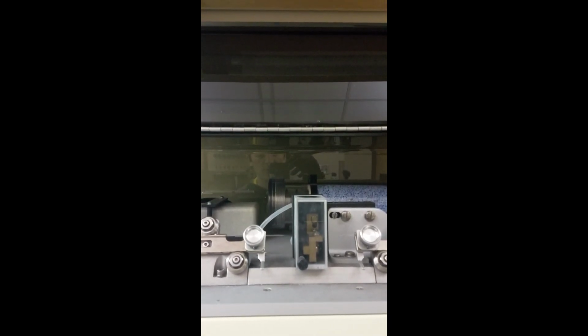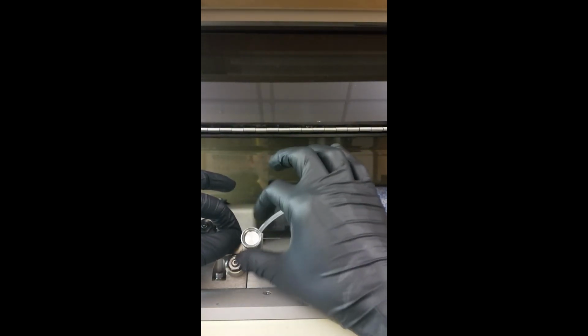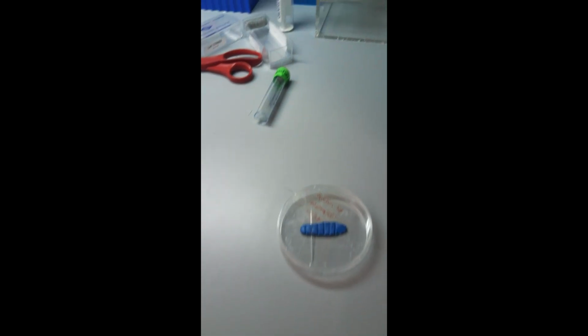You can open the lid and take out the new tips. So you just loosen this until you can pull this new tip straight out. As you can see, it's really fine and delicate, so you don't want to let that tip touch anything. And then you put it in this little case that we have just for holding the tips.